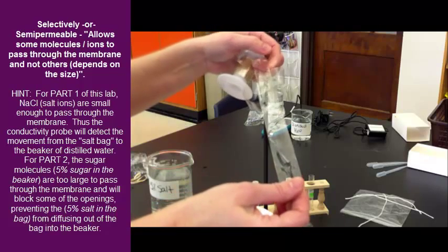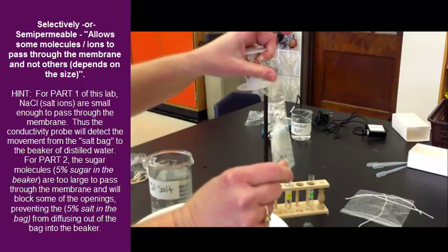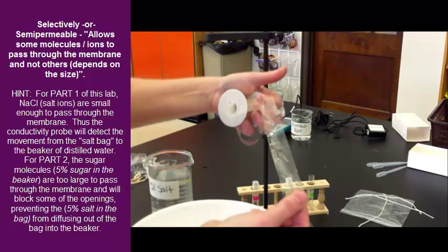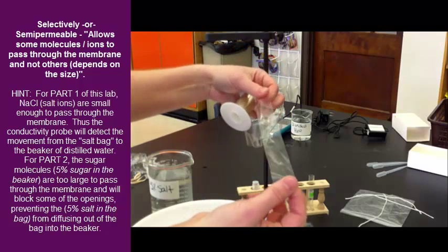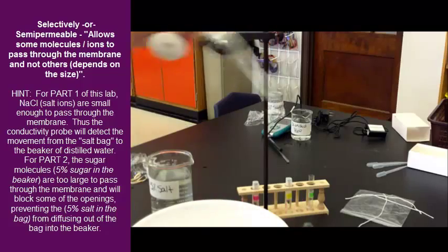So, if you're watching the video, and this may help with your write-up, it will allow salt to pass through because it's smaller, and then the sugar will not be able to pass through. It's too large to go through the openings.